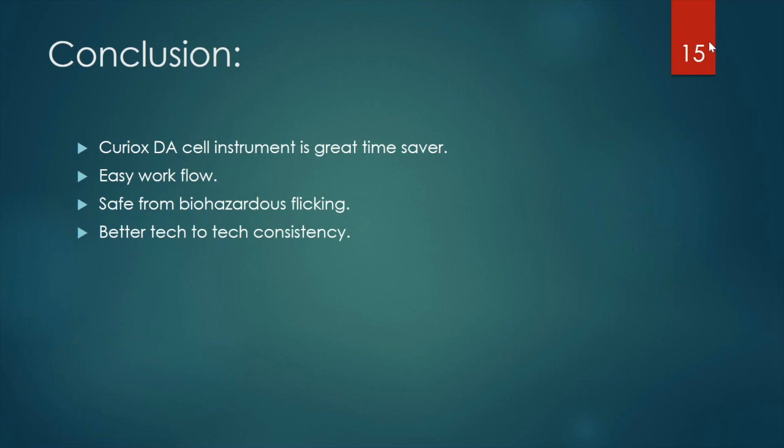Because I was the first one to use this instrument for my flow cross matching, there were lots of tests that had to be done. I did not know that residual volume was affecting my protocol, so I identified that after 3 testings. And I couldn't use 1 to 200 in this because of the droplet, the higher surface area. Your secondary antibody becomes unavailable to bind to your cells. So there is some secondary antibody that will become unavailable. That's the right way to put it.